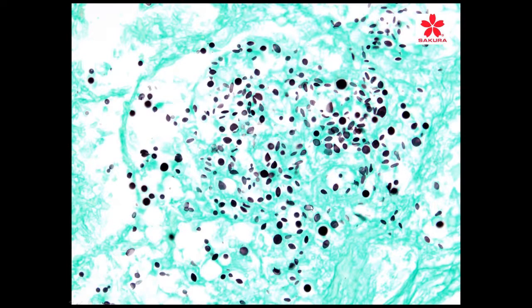But you see the oval appearance. But you see them a lot differently from these other oval-shaped appearances. And so more than likely, these are red blood cells that are picking up, as opposed to the true organisms that are picking up here. Once again, this calls for the need to have really good quality control when you do this and to be able to monitor it very closely. Now, the silver stain is one of the things that actually led me to believe that automation can be a very viable asset to a laboratory in special stains.